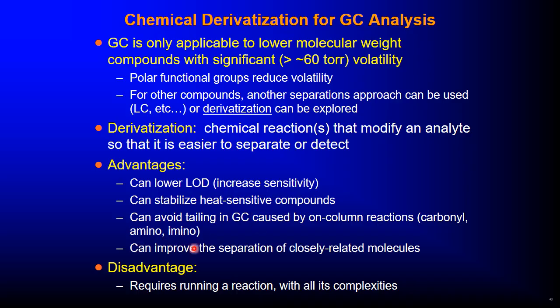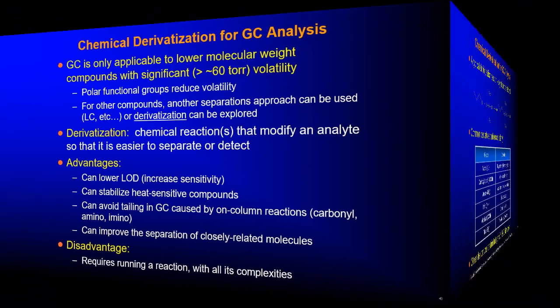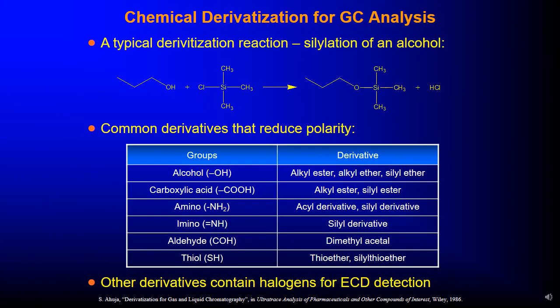It can also improve the separation of closely related molecules, so derivatization is very important. The disadvantage is that it requires running a reaction with all its complexities, so you really need to understand how those reactions will affect the final compound.